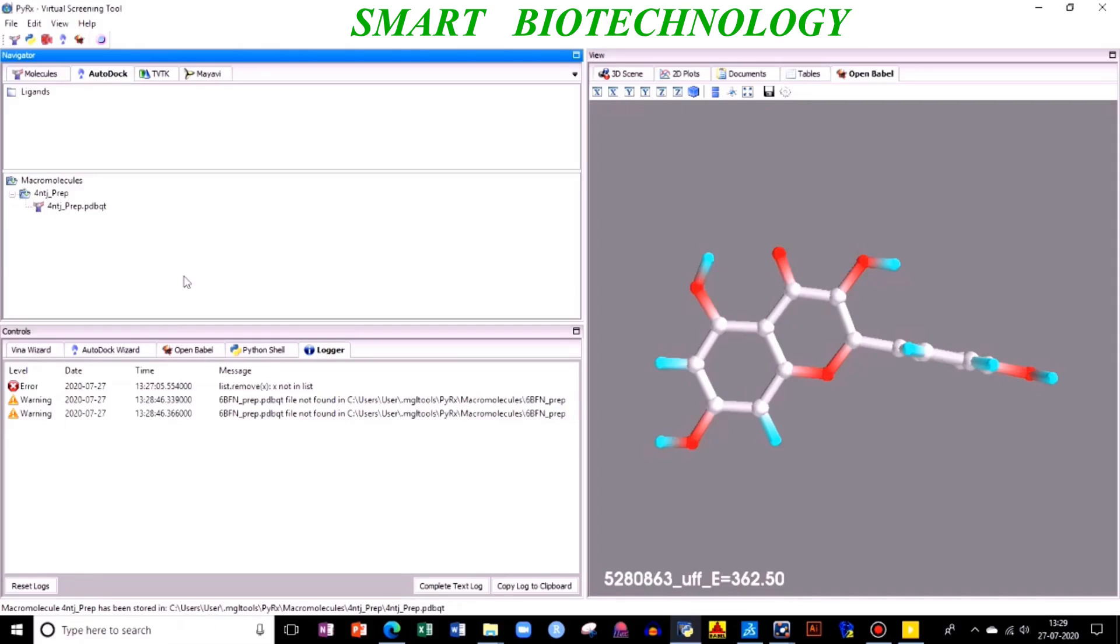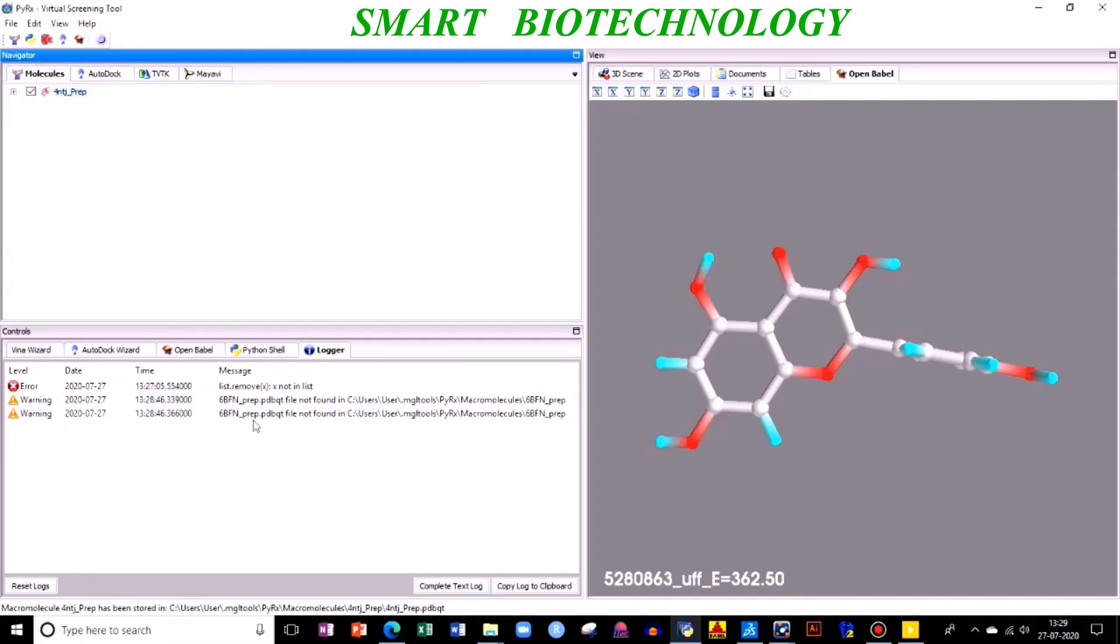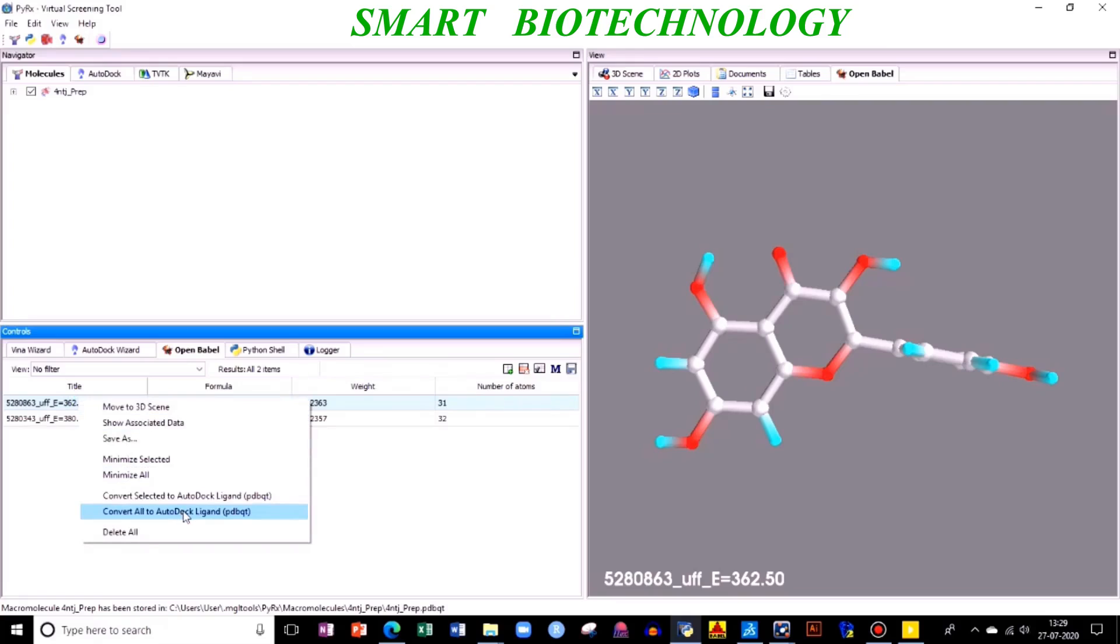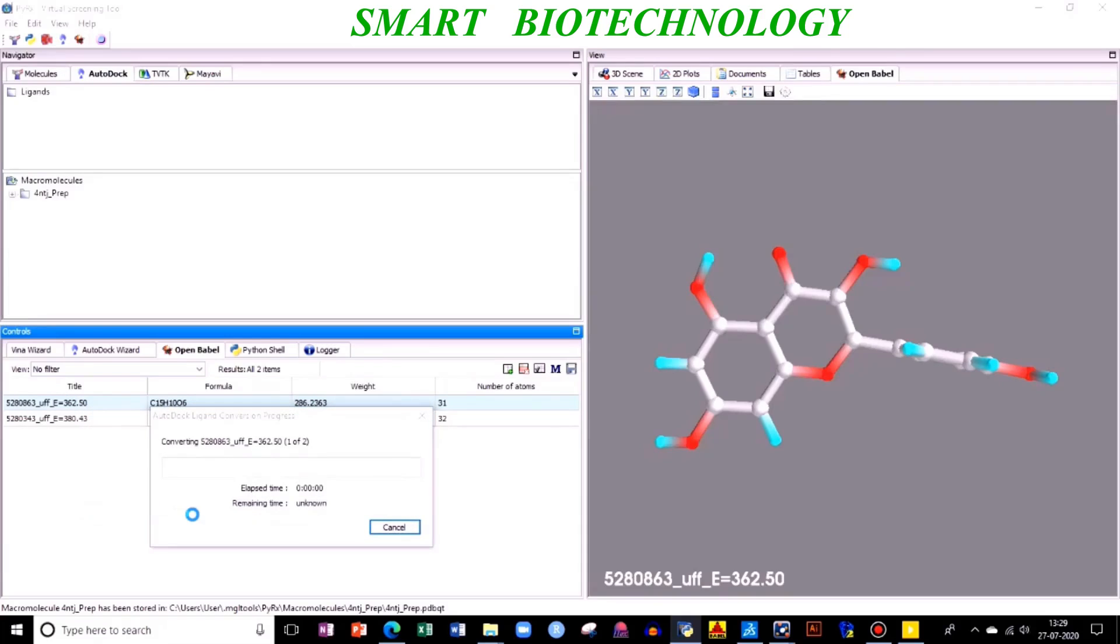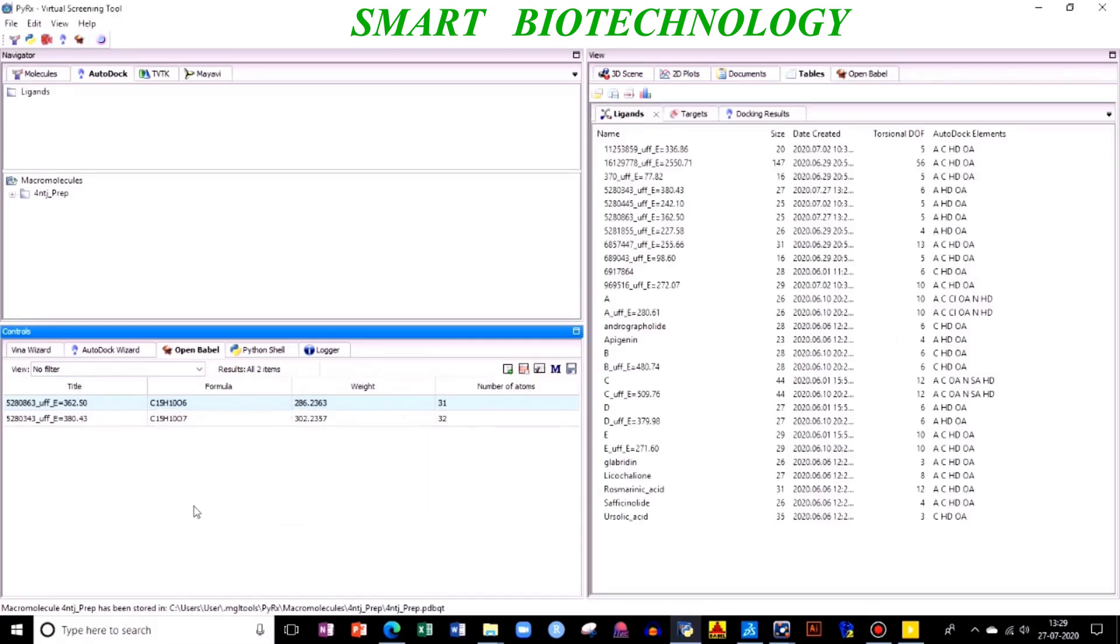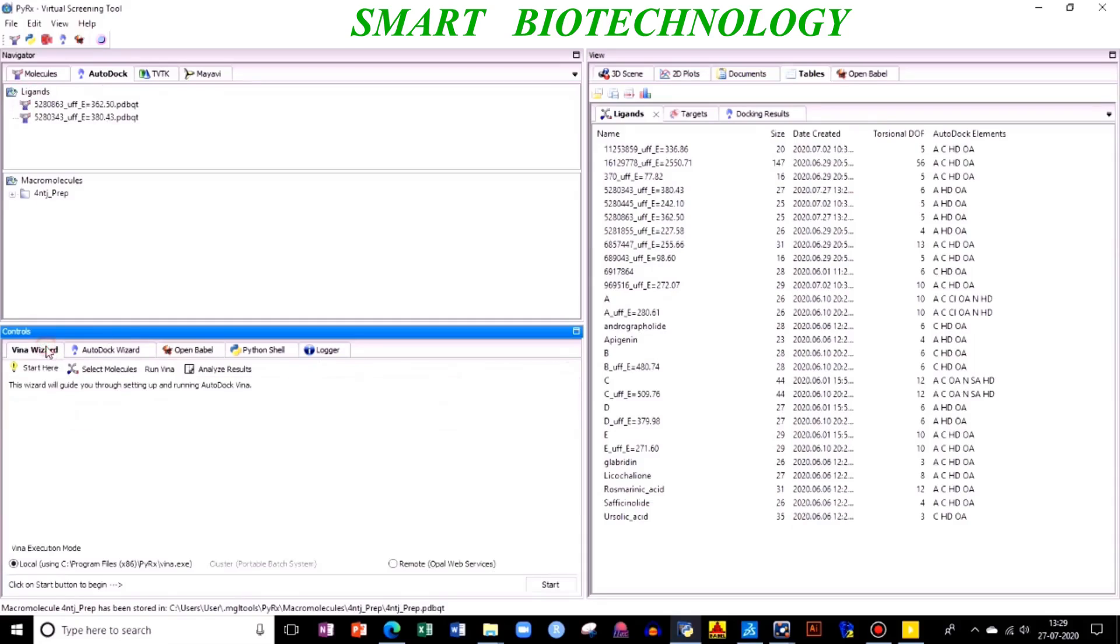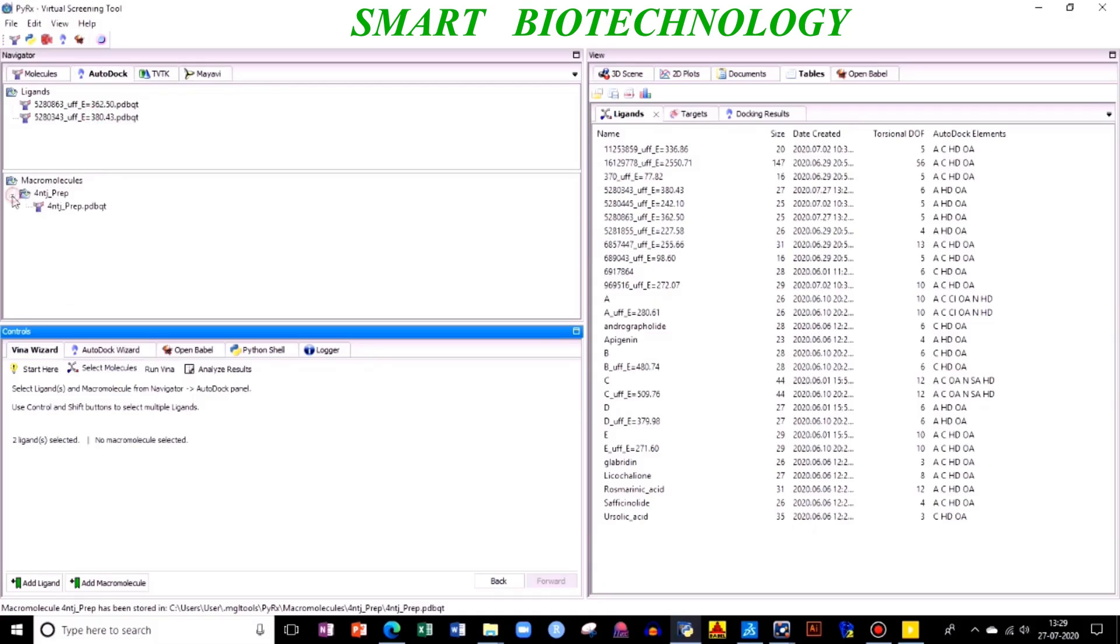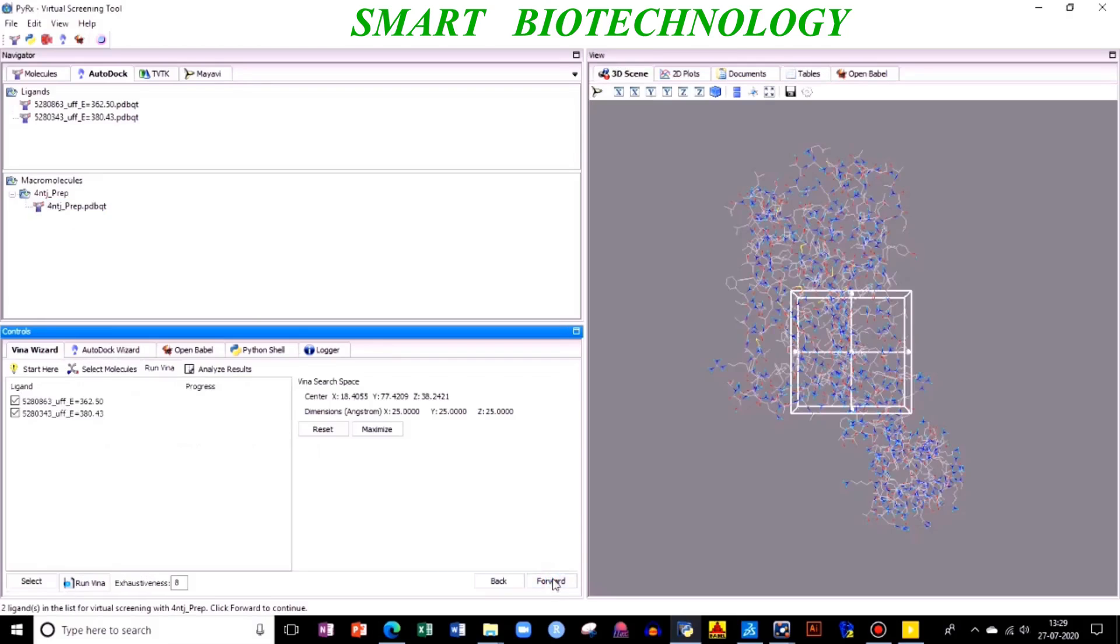PDBQT file is the file where your second preparation has been done - hydrogen bonds are added, Kollman charges are added, different charges are added to prepare your protein. Again go to macromolecule, Open Babel. Now you need to convert this ligand into PDBQT similar to your macromolecule. So right-click, convert all to AutoDock ligand PDBQT. Done. Similarly, when you click on ligand, you have PDBQT file. Now go to your Vina Wizard, then click on start. You need to press shift and together select, then select your left key, next forward.